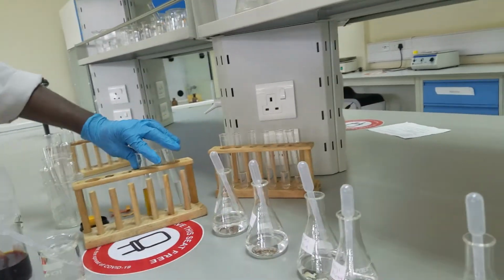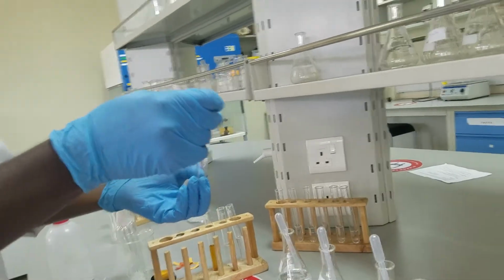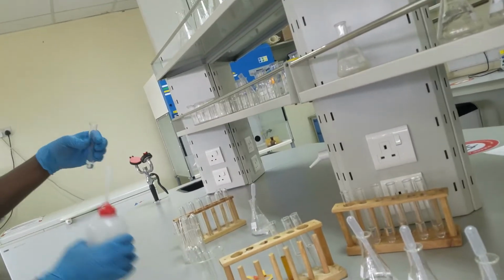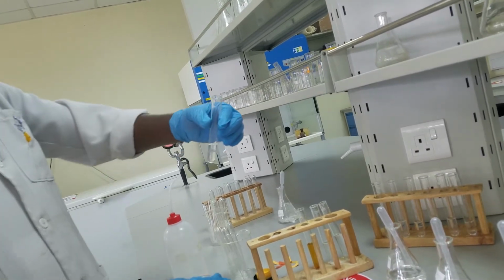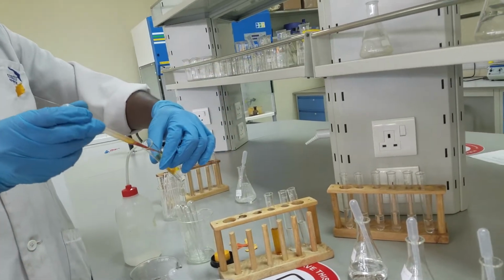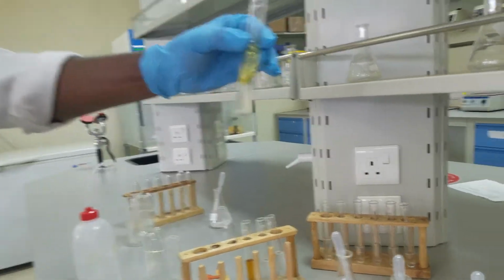Okay. Then the fourth one is ethyl acetate. Then a few drops of water, sodium hydroxide, and the solution of KI and iodine.